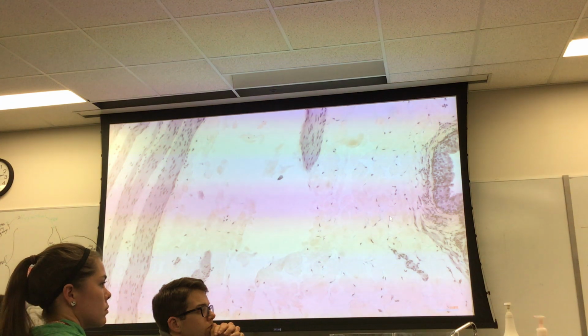We're going to use these tissues to identify this as an organ. Let me show you another example.